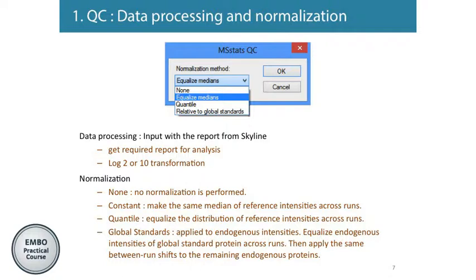It could be wrong. It's really hard to make that assumption. That means all the medians across the endogenous intensities, we need to think about it. This one could actually be the same or not, because if you use a different normalization, which is not good for your experiment, maybe your conclusion will change.